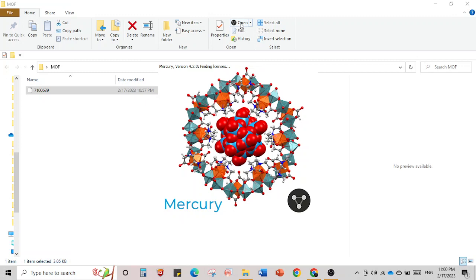This is the updated version of Mercury. If you have an old version it will look red — if so please go and download from the official site because Mercury is a free software, so please inform your friends also. It is not a crack version — anyone can download Mercury for free. There are many features available for crystallographers, with more advanced features available in an upgraded version.